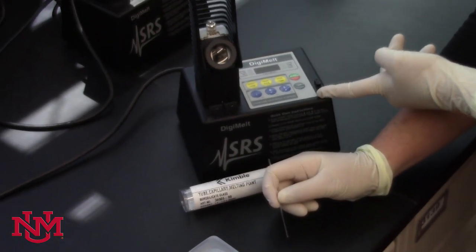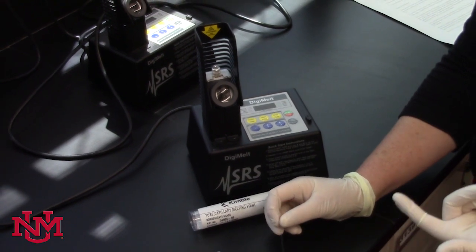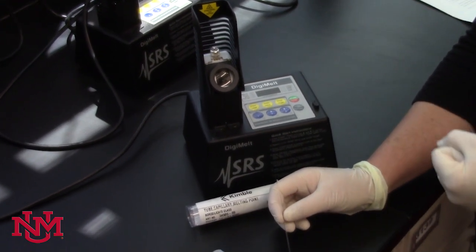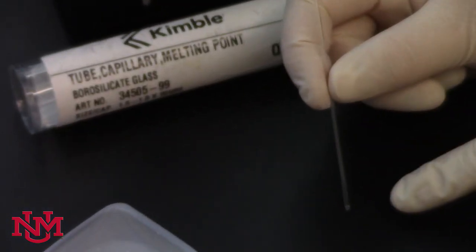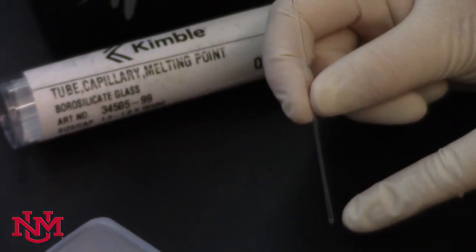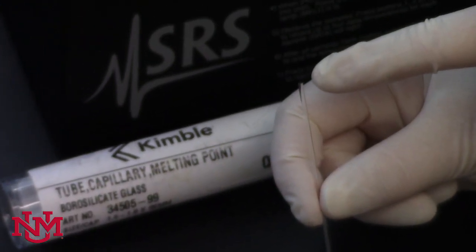We have digi-melts in our lab that are digital thermometers, and we also have some equipment we need to use in order to take the melting point. You'll need a melting point capillary. This is a glass tube that has a round sealed end and an open glass end where you add your sample.